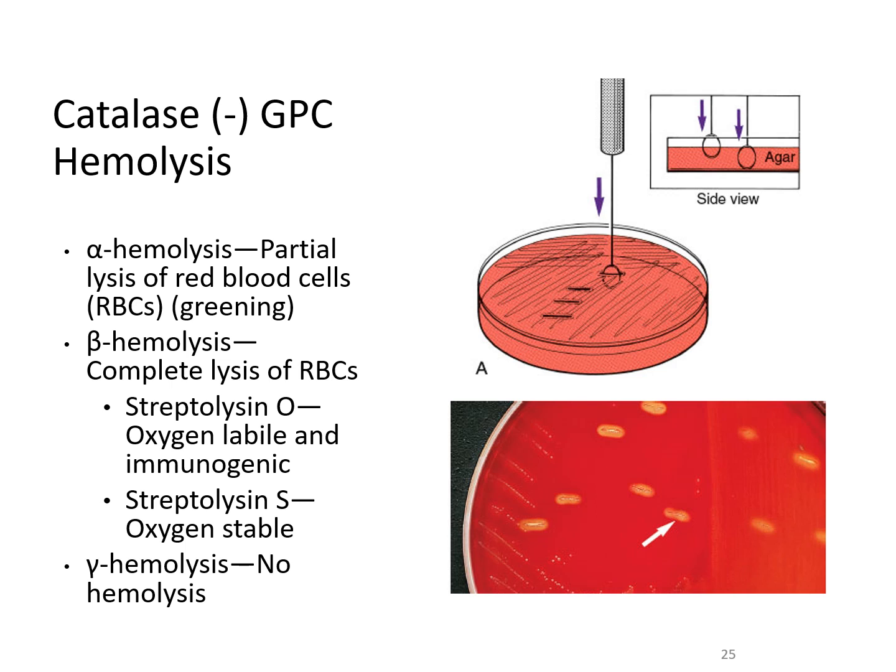And so with that, what we would do is observe the hemolysis pattern within our culture on our blood agar plate. And so a lot of times with throat cultures or genital cultures, the technician will do what we call a blood agar stab. And so when you're setting up this culture, when you do that streaking technique, and several of those streaks, you will take your culture loop and actually stab the agar deep down into that agar several times and in several different spots. And so what happens here is that it allows for the detection of streptolysin O.